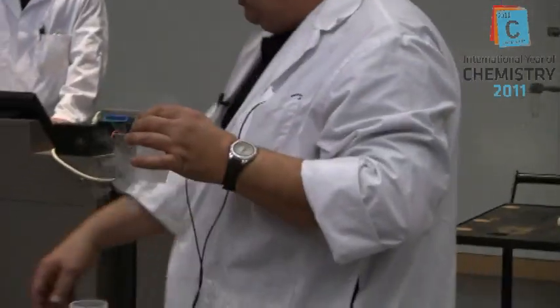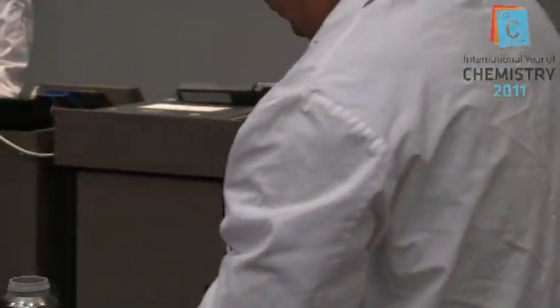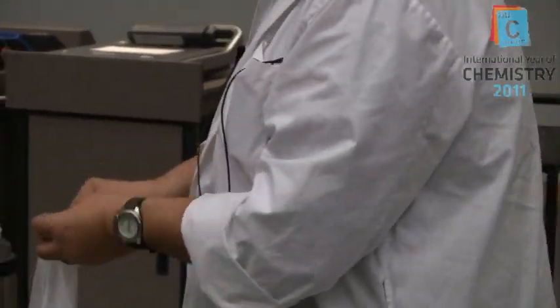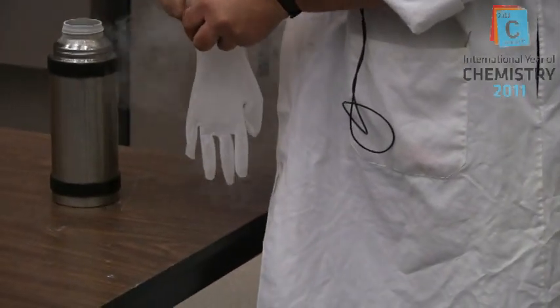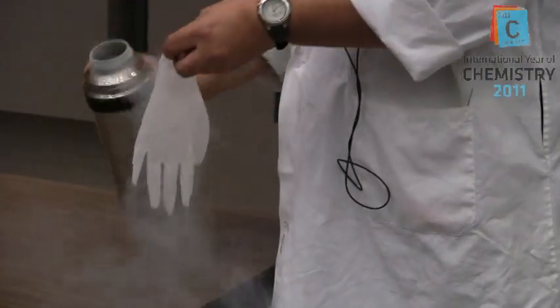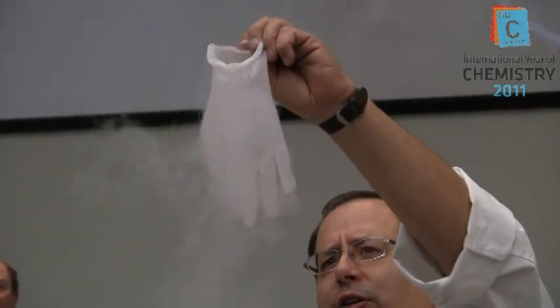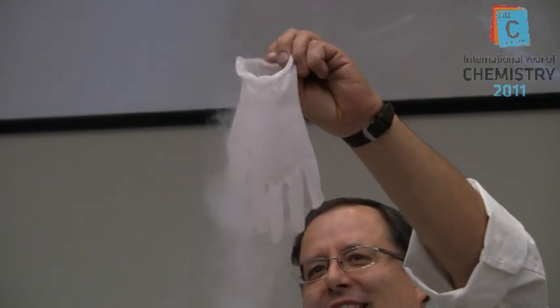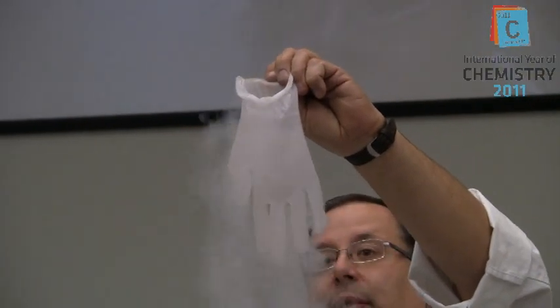I'm going to change the container here, and we'll go over to a glove. This glove is a different material, but if we place that in there, maybe I'll add a little more, you'll see that there's quite a bit more bubbling that's occurring here. Right? So that's what soup on a stove would look like if it were 220 degrees Celsius above water's boiling point. Well, at least the element here.